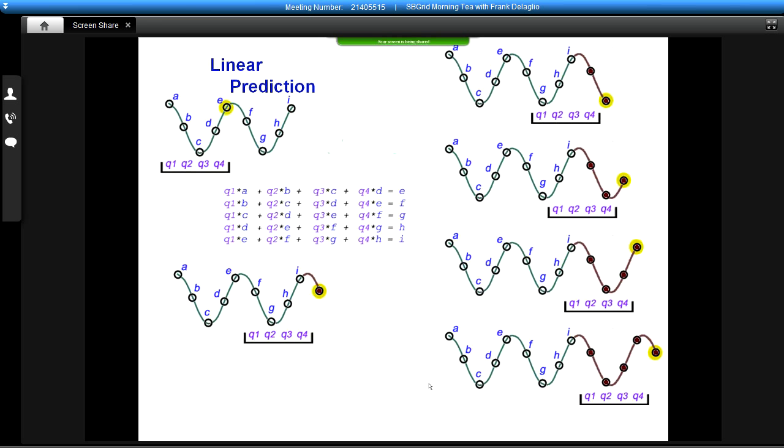And if we have more points to Fourier transform, these artifacts associated with the Fourier transform that we've seen are not as severe. So the way we use linear prediction for this extrapolation purpose is a two-step procedure. In the first place, we make a linear prediction model, and in the second place, we use that model to add synthetic points to the corresponding spectral data.